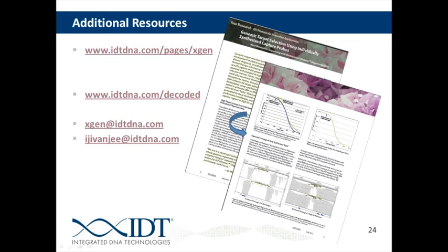And I think there's one more question regarding the 500 kb. I guess he or she has purchased two 500 kb panels. I think it just depends on whether this panel is being used to supplement their existing one.